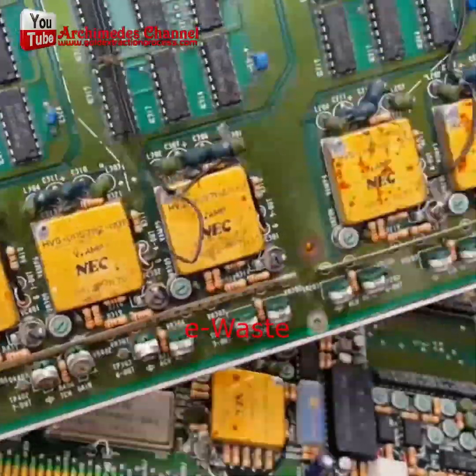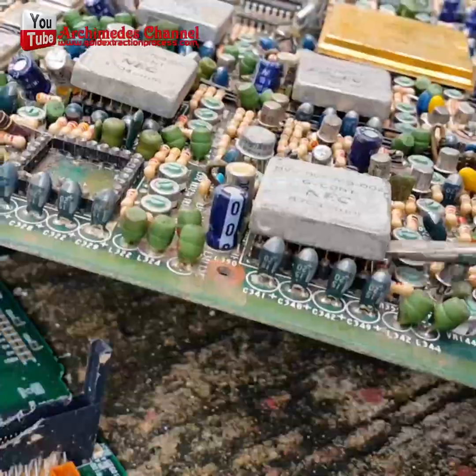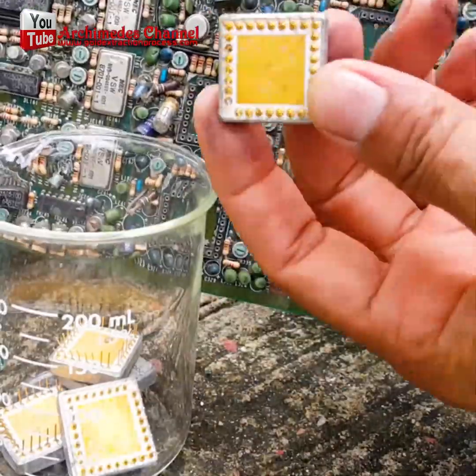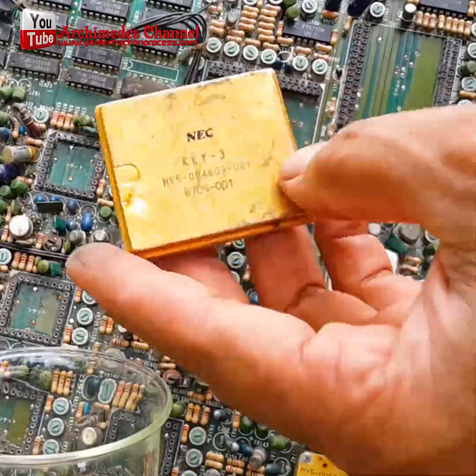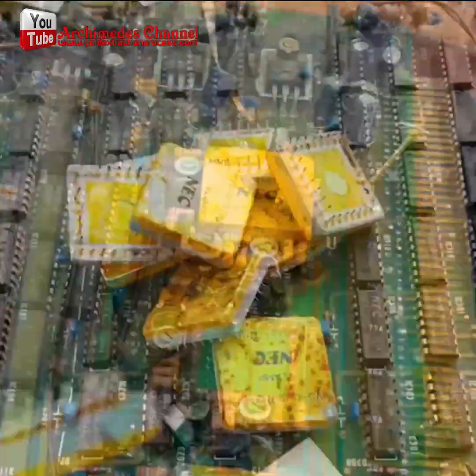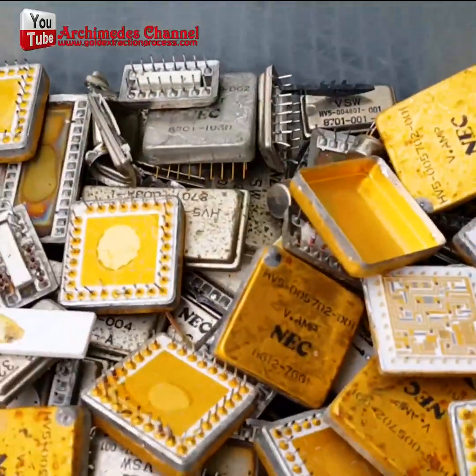Did you know there's gold in all the electronics around you? Whether it's a thin coating on a connection or a microchip, it's there in tiny quantities. And if you've got old electronics, you can run an experiment and try to extract some gold, just like this.